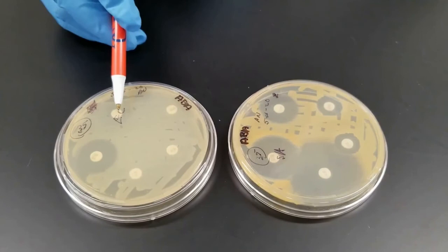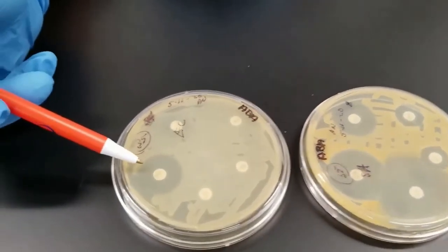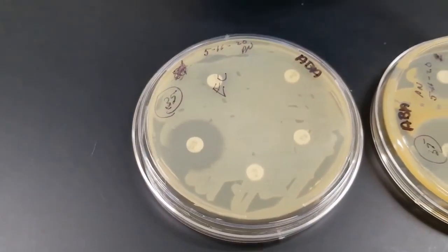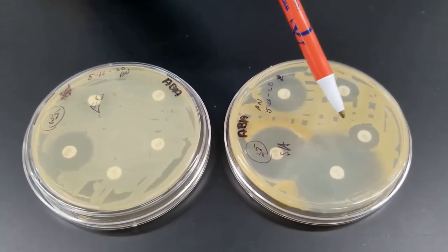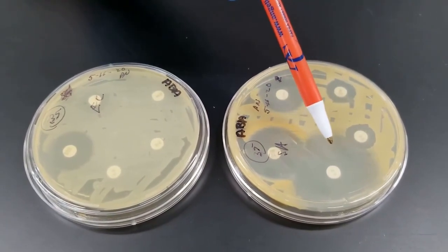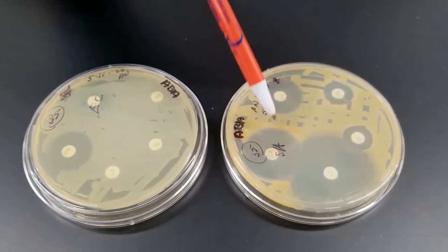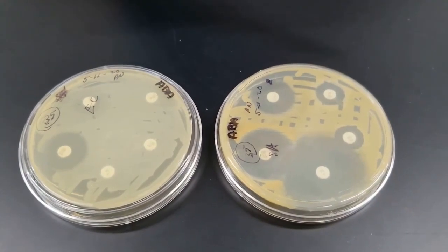And then up here we have erythromycin. So for the gram-negative, the only one that was inhibitory was that tetracycline. Over on the gram-positive, once again, all 5 of them were. If you had to rate these, the most effective would be the penicillin. Then it looks like tetracycline, erythromycin, Bacitracin, and then finally vancomycin.